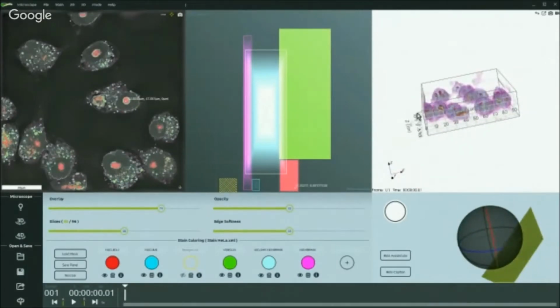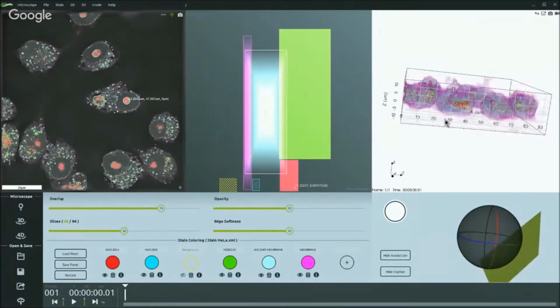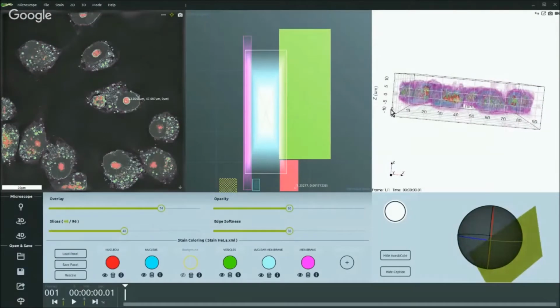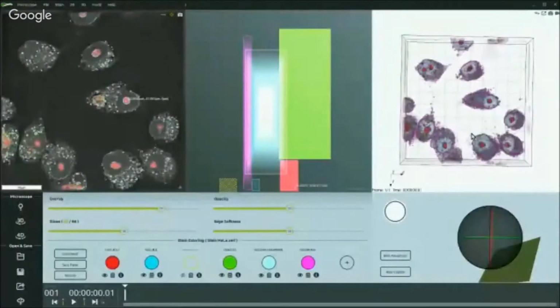You have here your Z axis, so 0, plus 15, minus 15. And here you have your X and Y axis. Okay. There is an objective below the stage. So it is fixed and it controls the field of view that can be used.